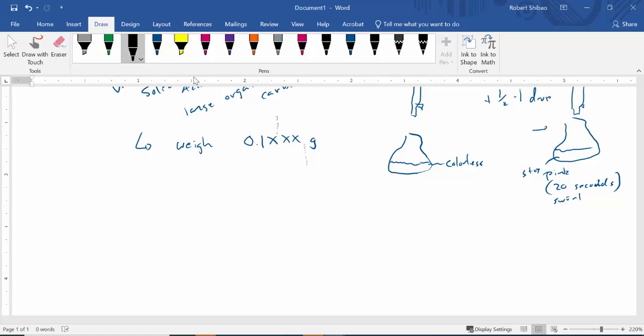All right. And so what we're going to do is calculate the optimum. We're going to titrate this and get the milliliters. So you're going to have your 0.1xxx grams over however many milliliters. There's going to be xx.xx milliliters here.